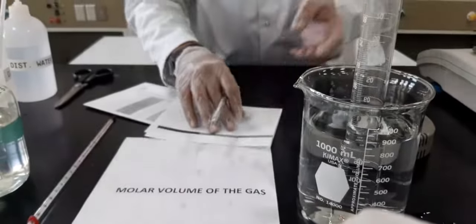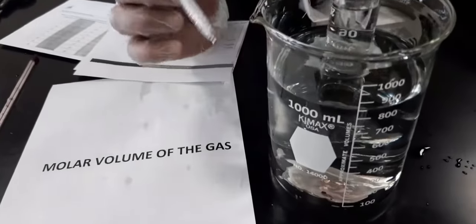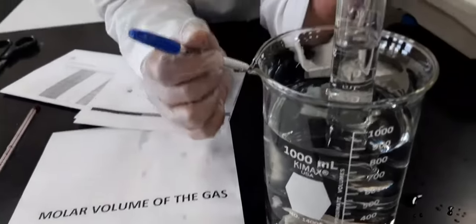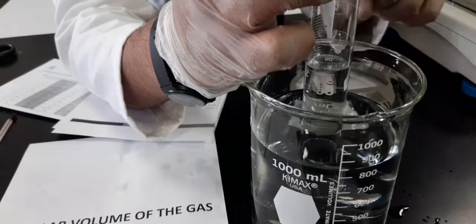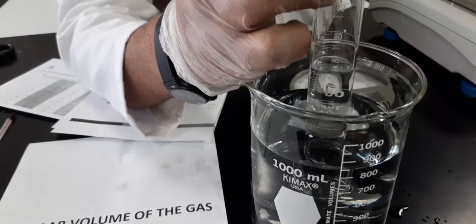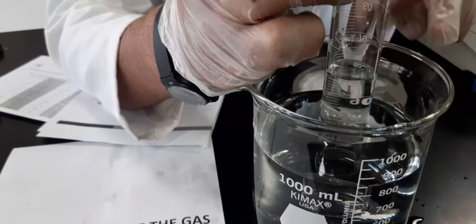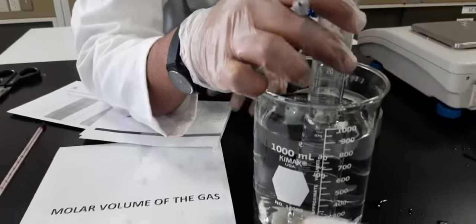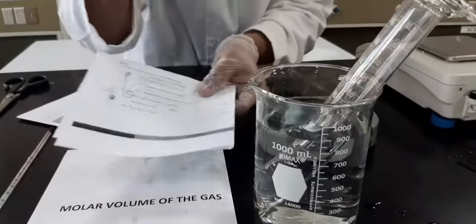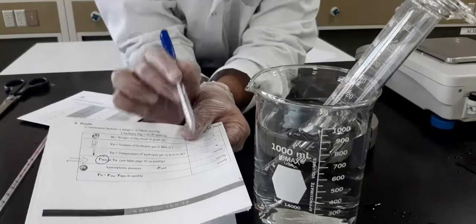You can lift the cylinder until the mouth of the cylinder is still dipped inside the water, and then you can have a close look by coming down to your eye level exactly to the layer, and you can expect this is 70 right there, so almost 79. This says 79 ml. Remember, when you write in your observation column, you write 79 multiplied by 10 power minus 3. We are converting into liters.